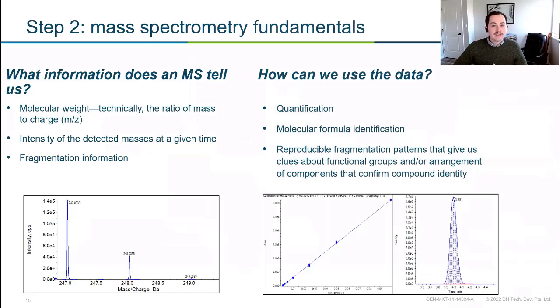But first, what kind of data does a mass spec give us? In the simplest terms, the mass spec is really looking at a mass. We're reading a mass and we're getting an intensity at a specific time. And I say mass or molecular weight, but really it's an M over Z. So it's the molecular weight over the charge. And we'll go over what that means in a little bit and give some examples of that. But since we're talking about MS in this talk, we'll also have some fragmentation information.